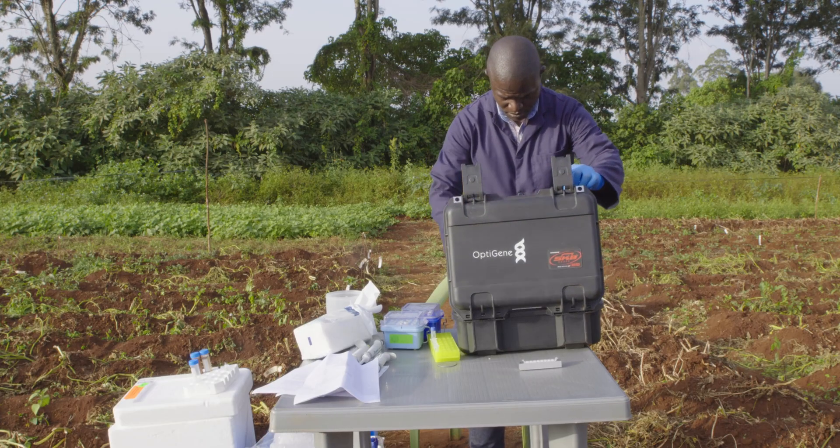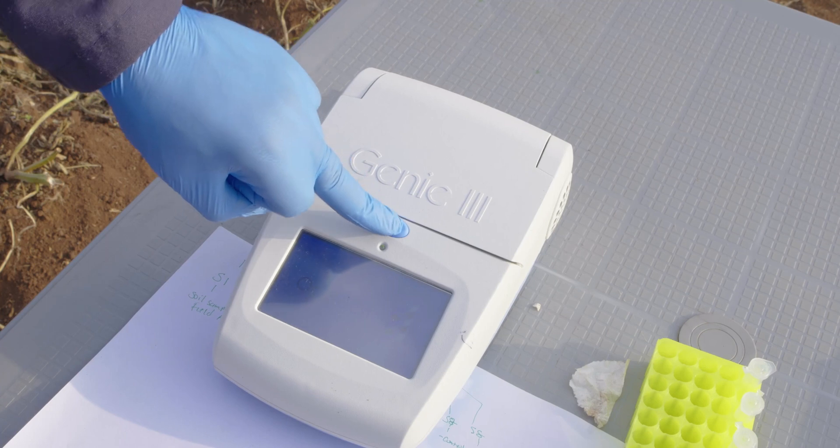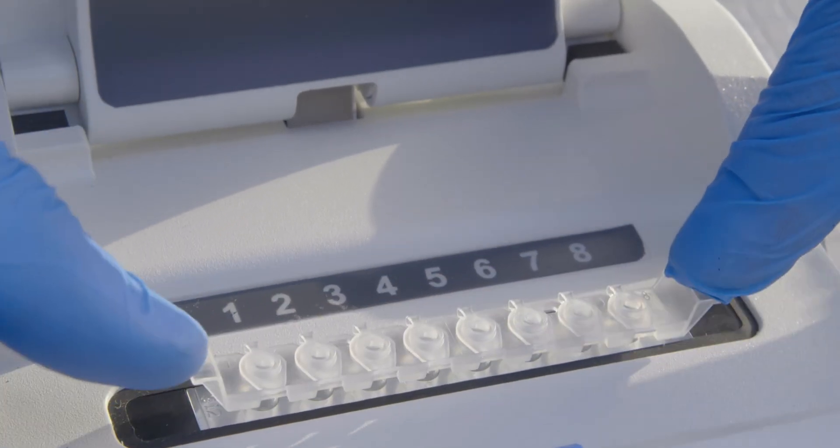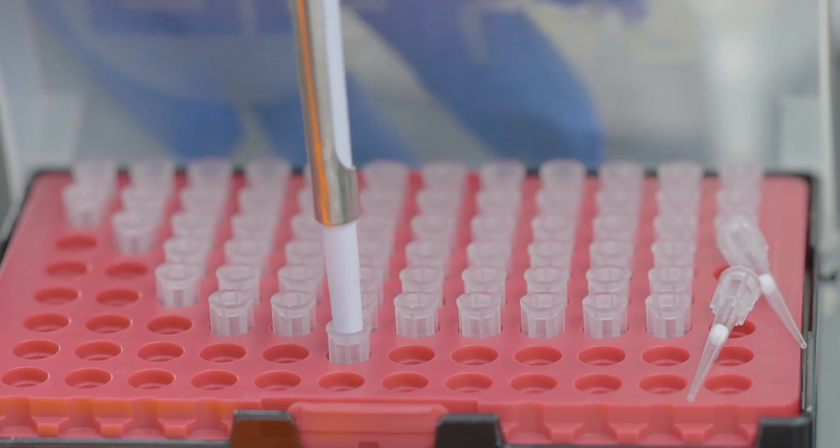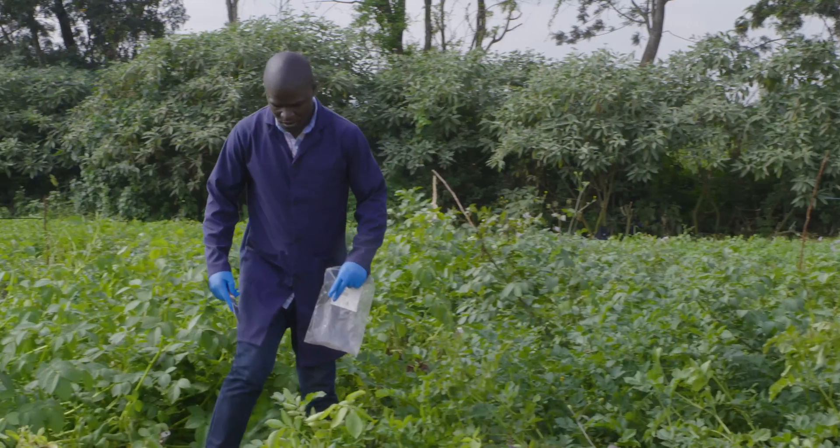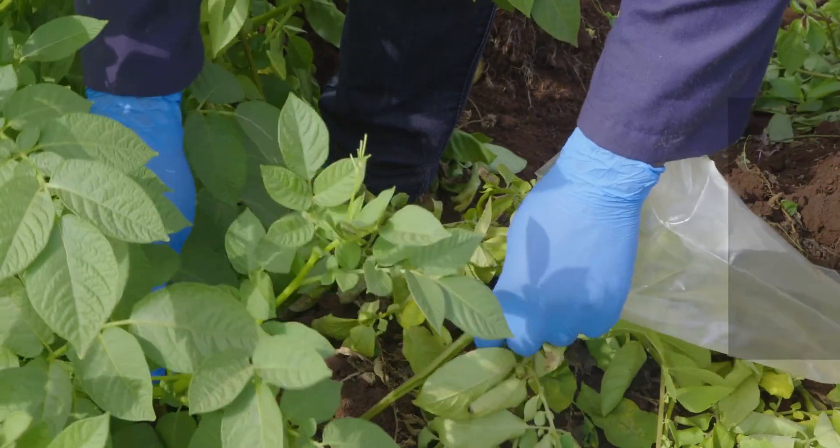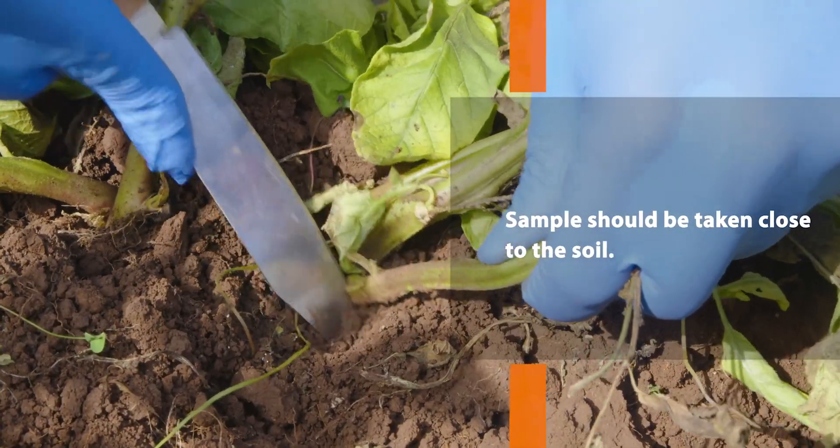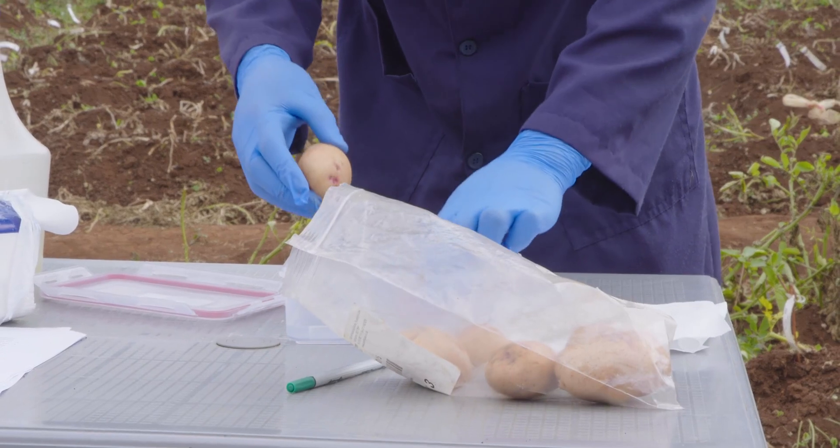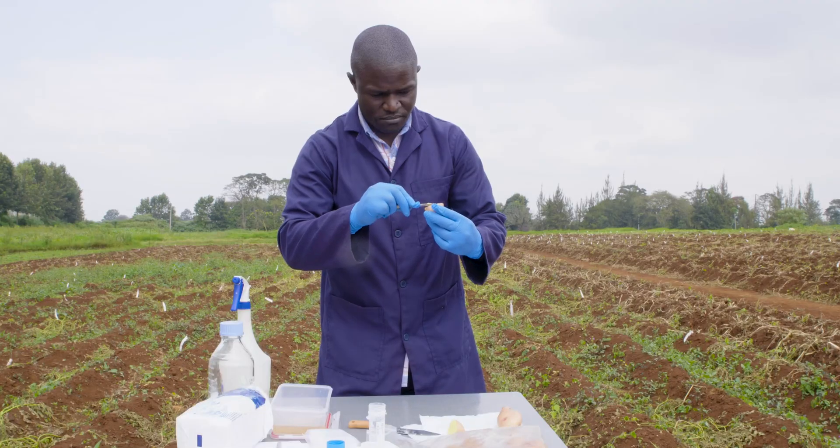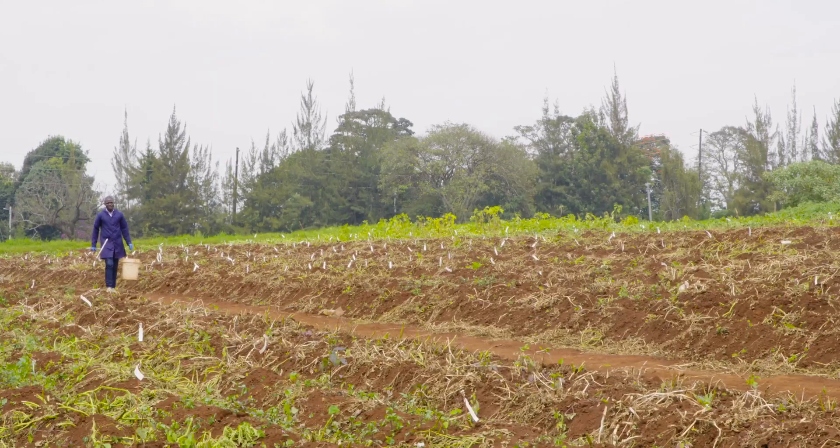Sensitive and specific loop-mediated isothermal amplification assays have recently been developed. The CGIAR's International Potato Centre has validated these innovative approaches to take the testing process from the lab to the field, all while increasing the efficiency and effectiveness of the certification process, lowering testing costs and assuring seed health.